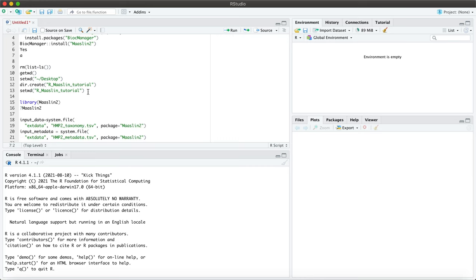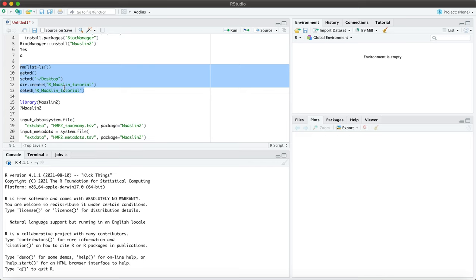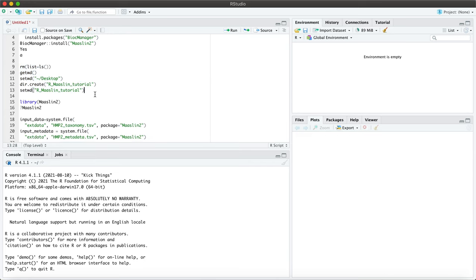And then here you would want to set your working directory. We would be creating a specific folder where we can have our output data saved to, just makes it easier to have everything in one folder and then update your working directory to that folder afterwards.